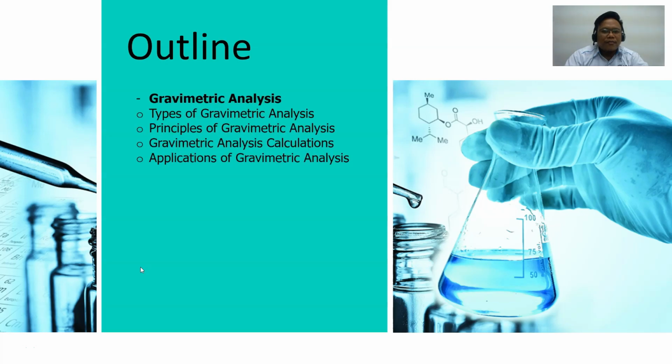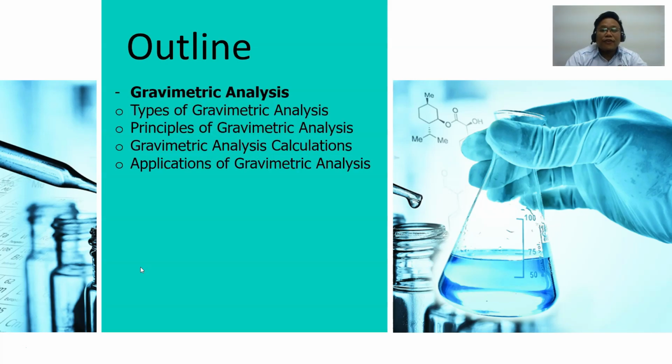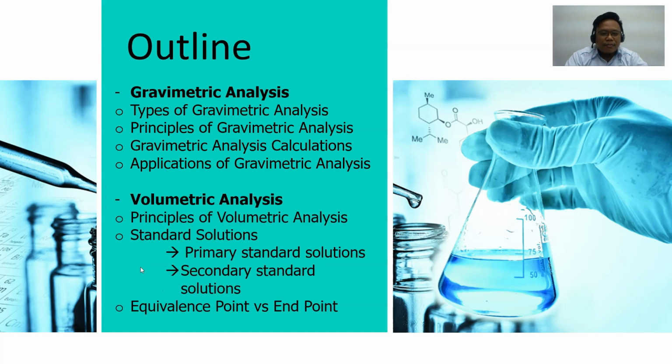I will explain two subtopics. The first one is the gravimetric analysis. In gravimetric analysis, I will cover the types of gravimetric analysis, the principle of gravimetric analysis, the calculation involved in gravimetric analysis, and of course the application of gravimetric analysis. The second subtopic is about the volumetric analysis.